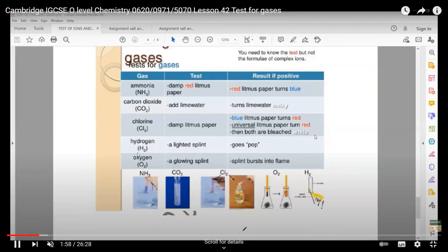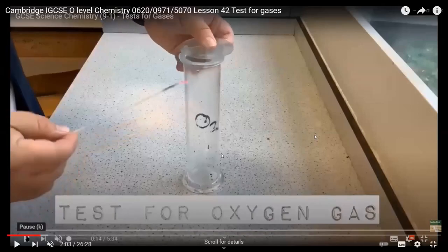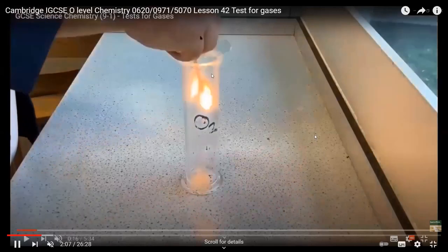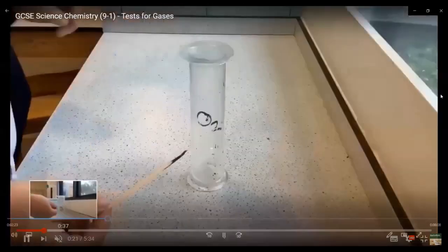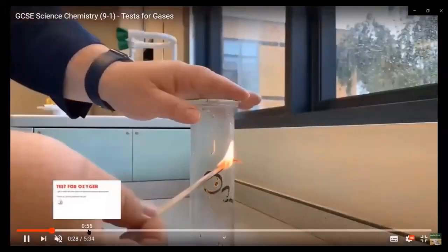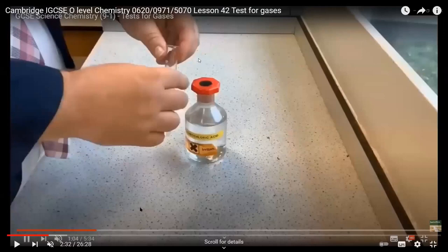For example, the first one: if you want to identify oxygen gas, this is a glowing splint. You don't see a flame on the glowing splint. To test for oxygen gas, we place it in a gas jar completely filled with oxygen, and you can see the glowing splint relights or bursts into flame, because oxygen supports burning. Oxygen helps in burning, which is why the glowing splint will relight.